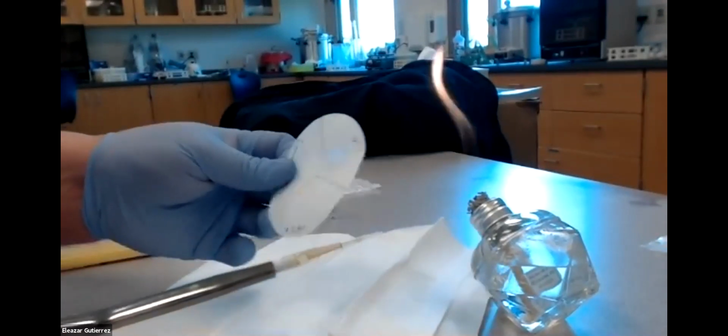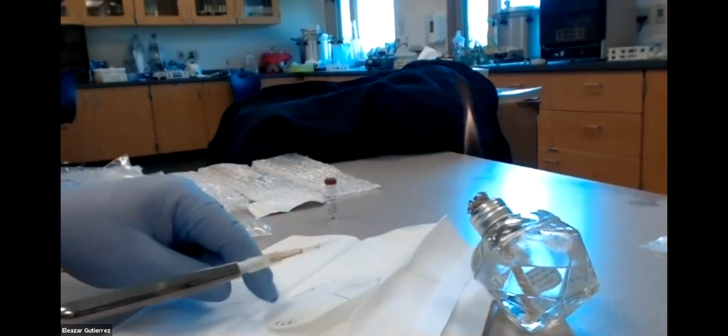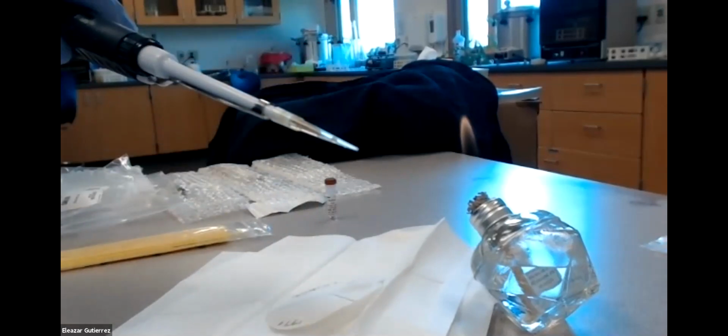So that's all there is to this investigation. You do the other one with Micrococcus luteus, and the other one is Staphylococcus epidermidis. I'm going to put my tip in isopropyl alcohol and move on to the next experiment.